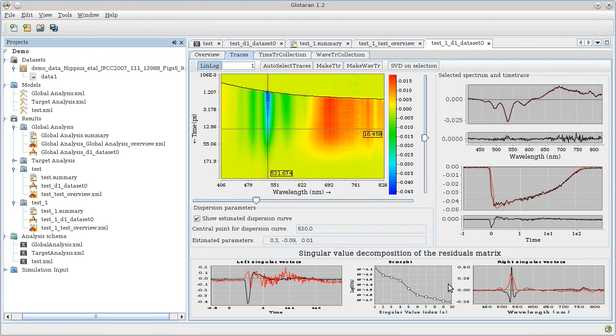This little trick should make testing many models less painful and allow you to quickly zoom in on the right model. Of course, when you are finally happy with your model and the quality of the fit, then you still need to make sense of the analysis and try to give a physical interpretation to the results. And that is usually where the real challenge lies.